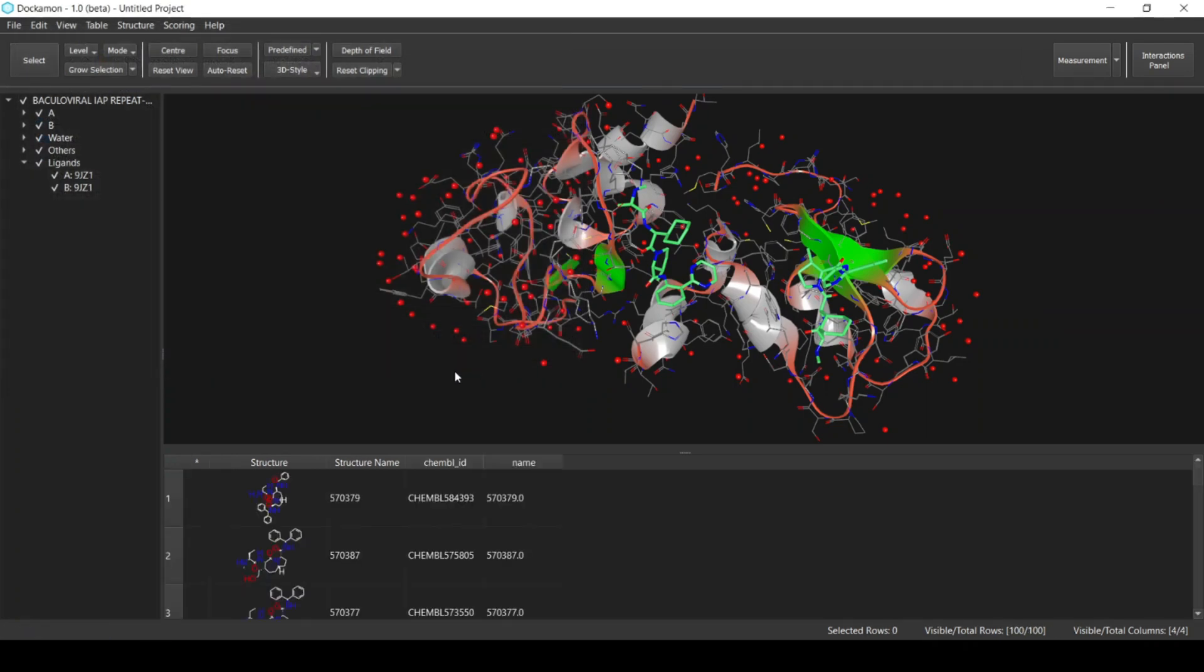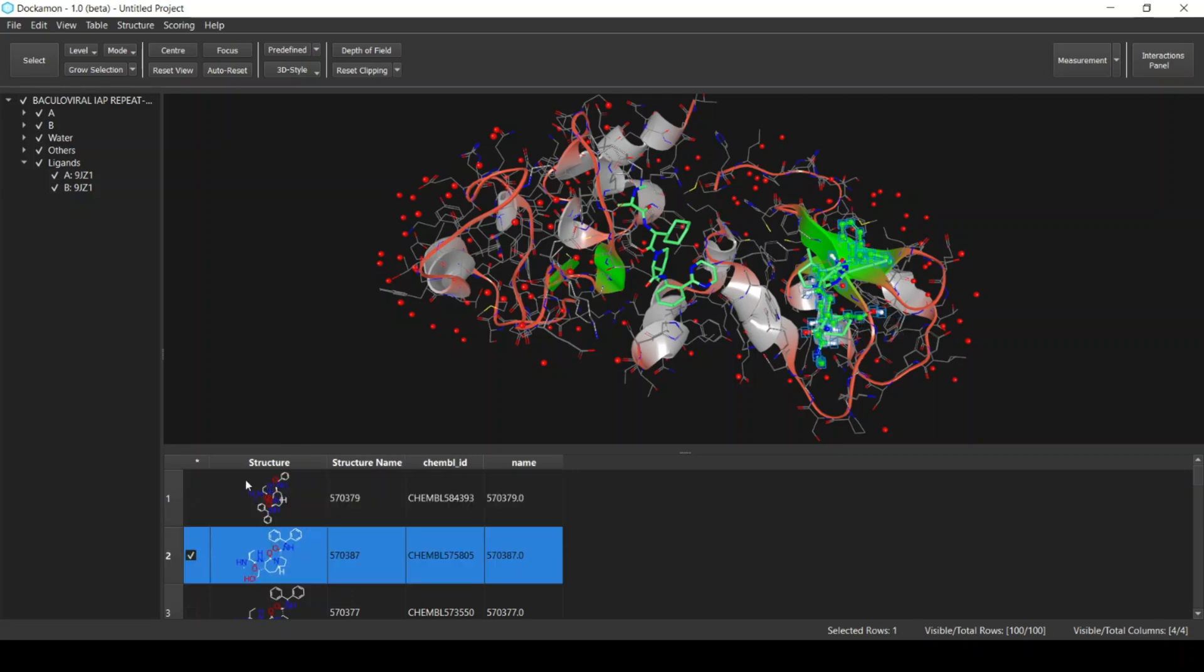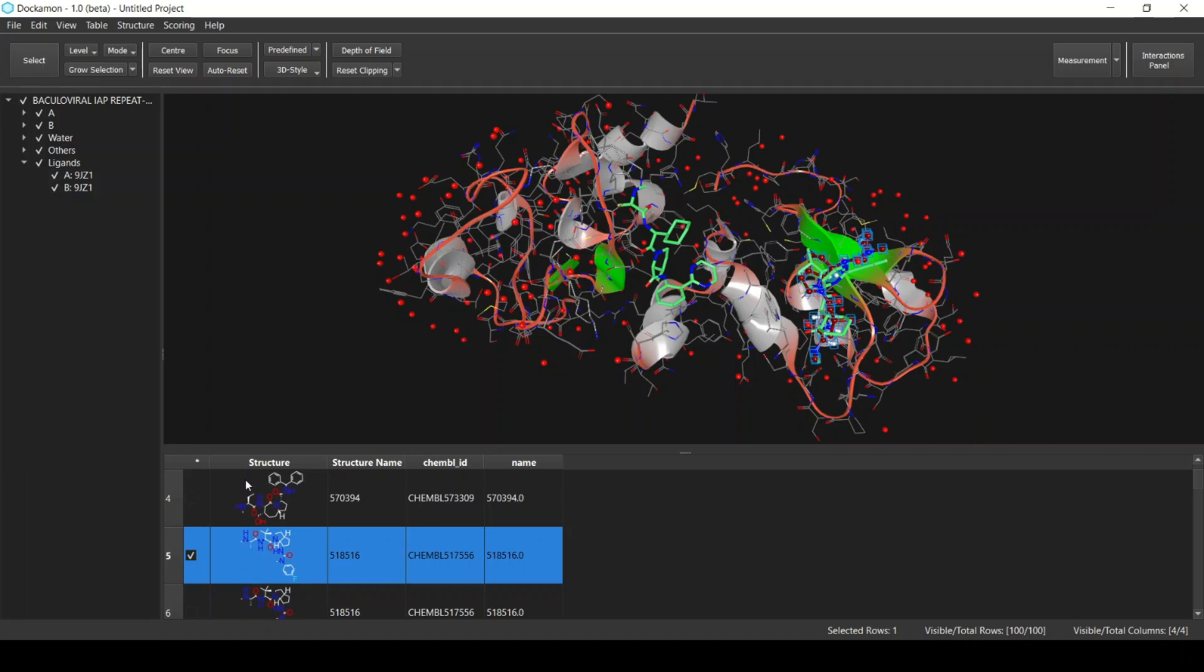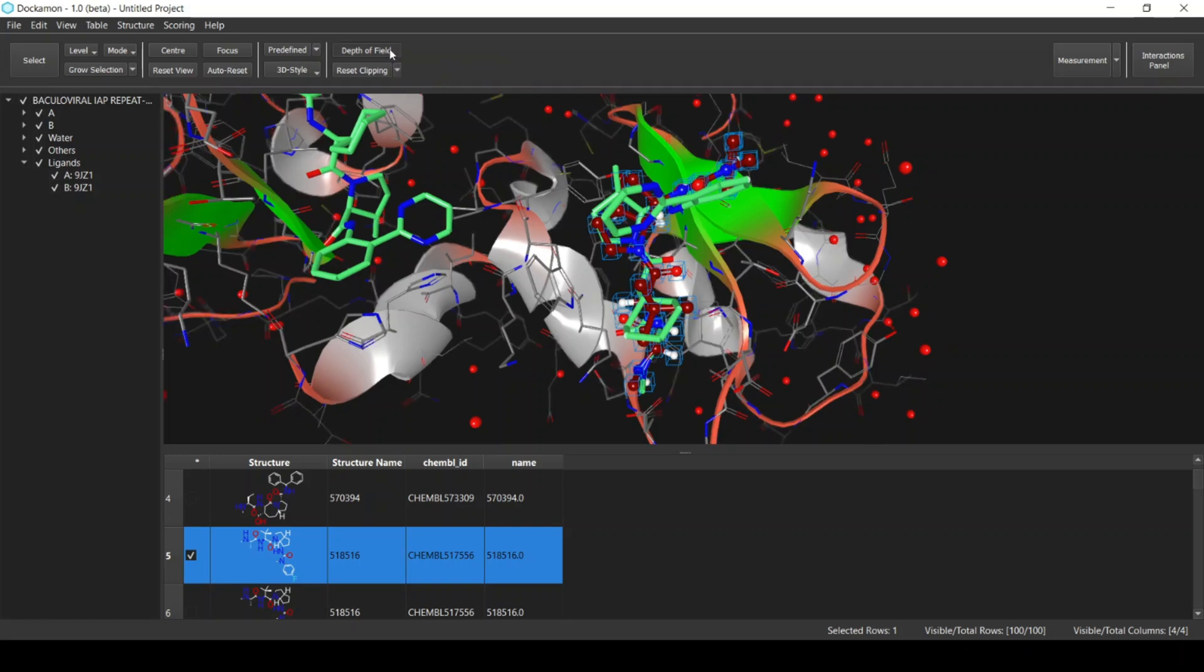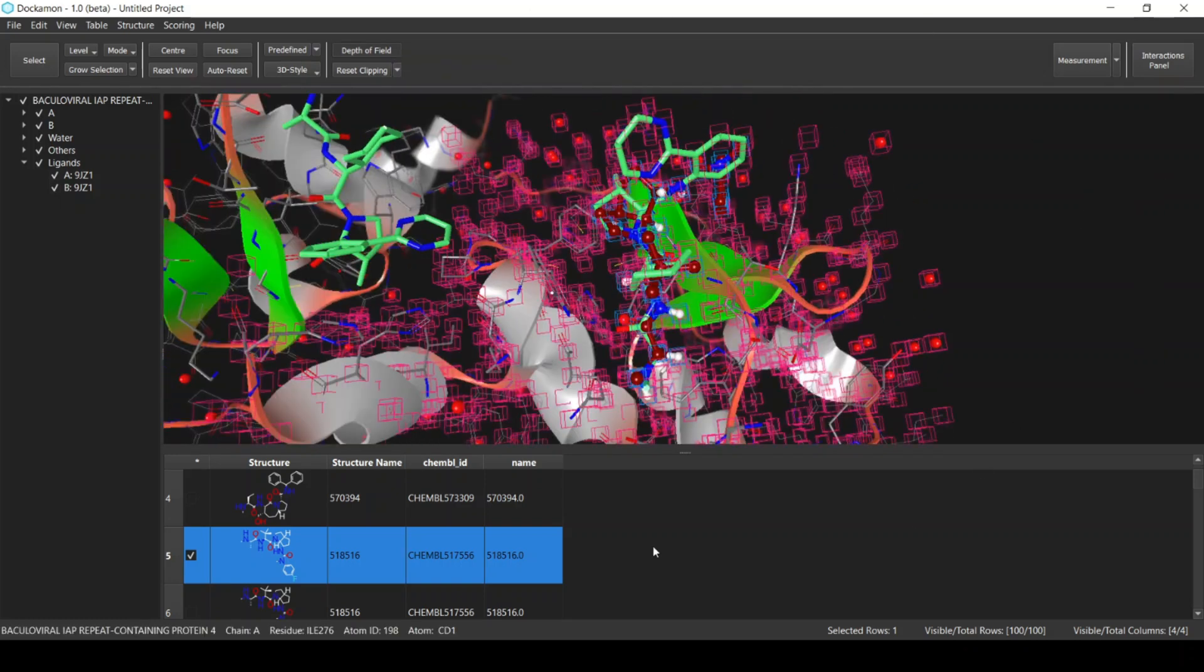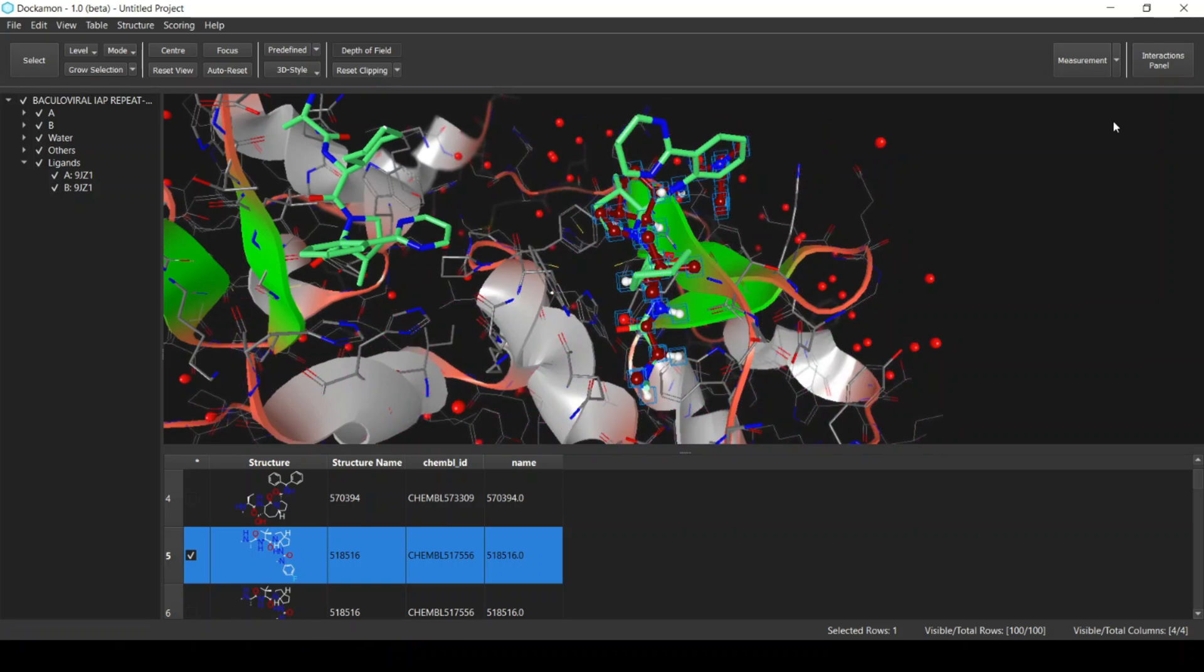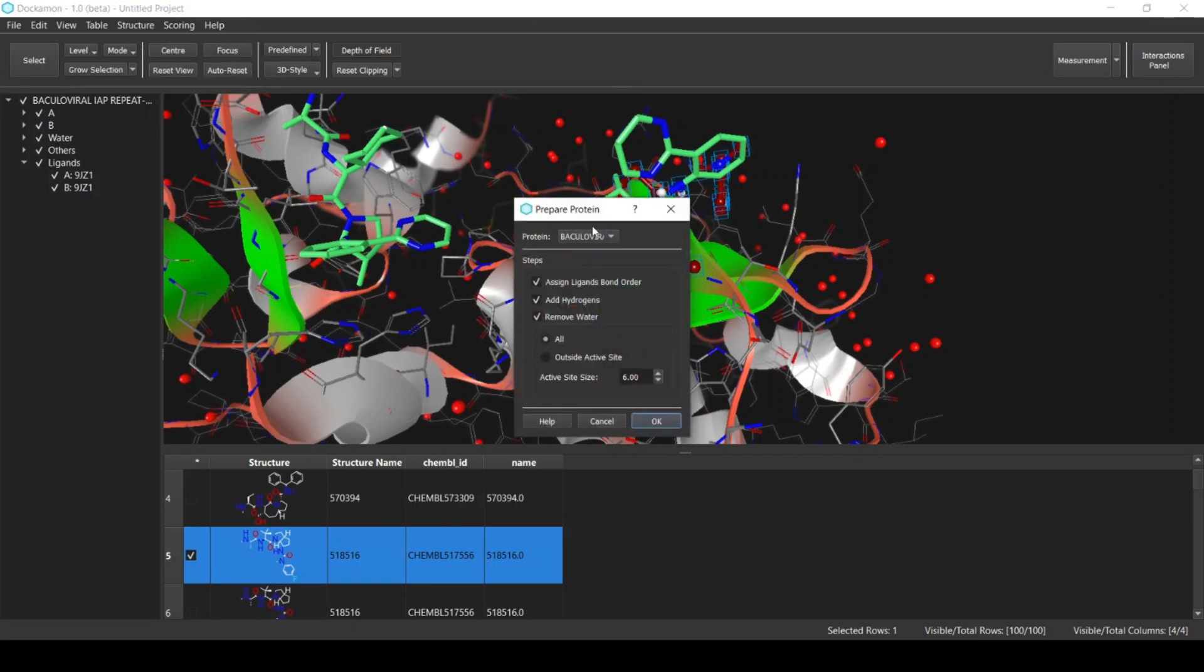Now the ligands have been imported. These are pre-docked ligands, meaning they have been previously docked. I click Focus to focus on the ligands, and also I will activate the depth of field to get a better view.